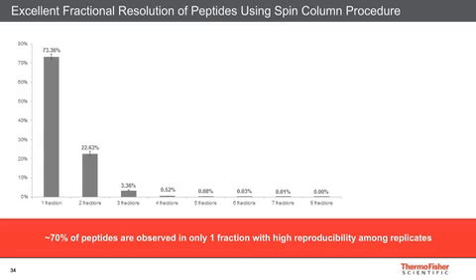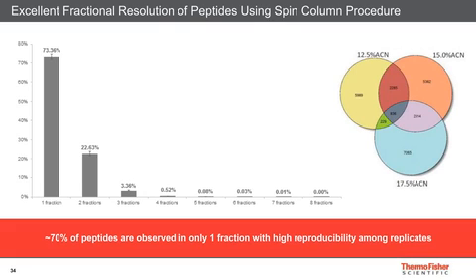As you can see, the peptides prefractionated on the low pH mode in the middle panel are not distributed across the LCMS gradient, in contrast to the high pH mode in the lower panel. This distribution of peptides in the high pH fractionation mode results in better sampling during LCMS, leading to more peptide identification.